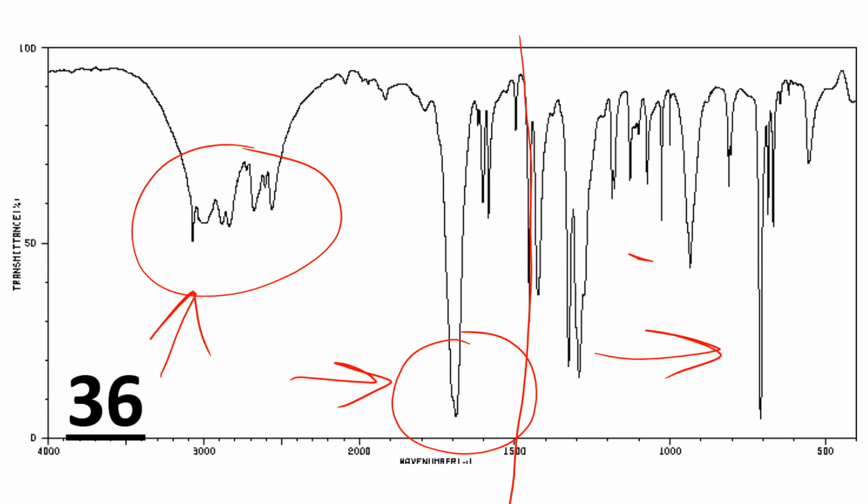So as soon as we see an O-H, we can say, I know it's not an aldehyde or a ketone. I know it's not an alkane. I know it's not an alkene. So we want to eliminate things, and hopefully we should have only one or two things left, and the other graphs can help us fix that one. That's it.